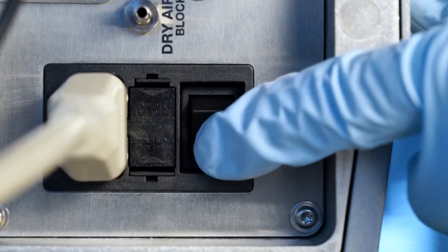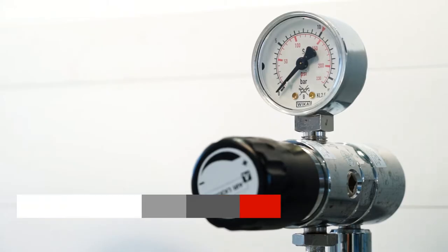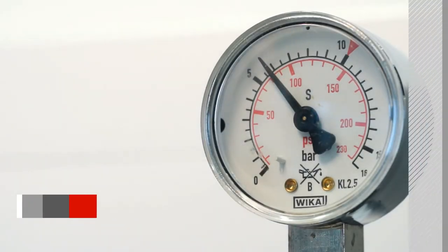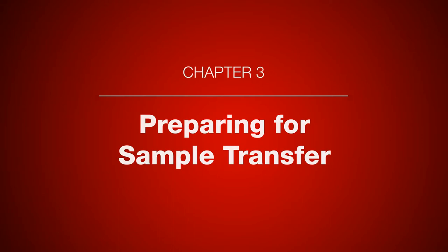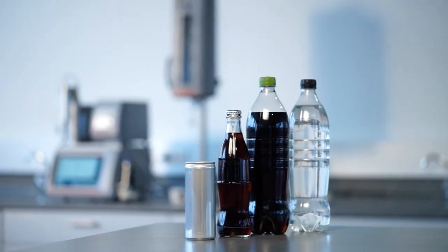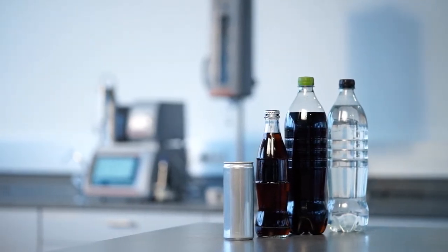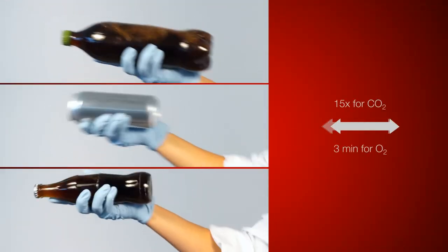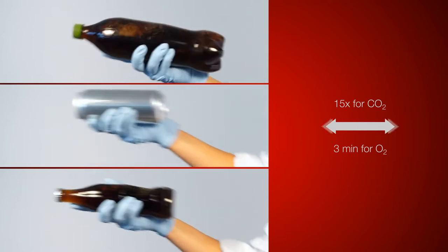Turn on the device and set the supply pressure to 6 bar. Please prepare your sample for transfer. To do so, shake your sample horizontally to properly establish equilibrium between the CO2 and O2 content of the headspace and the liquid.